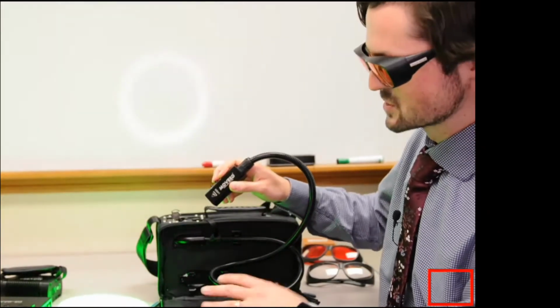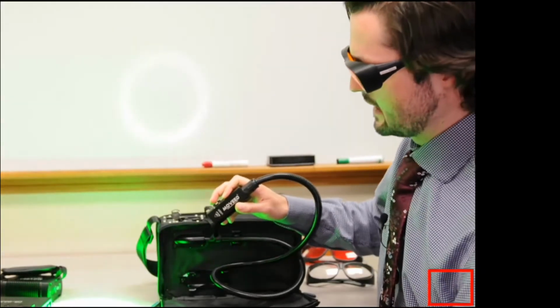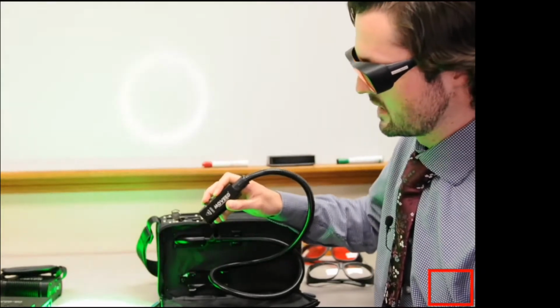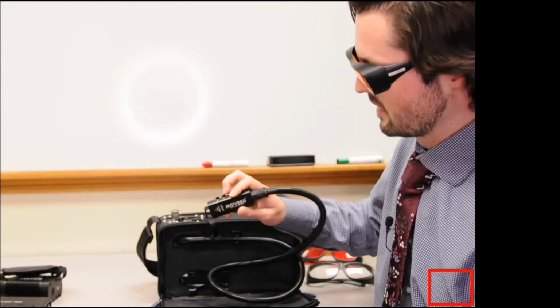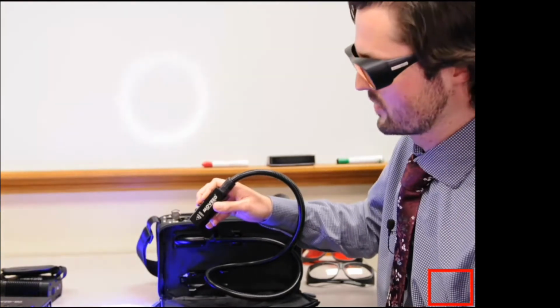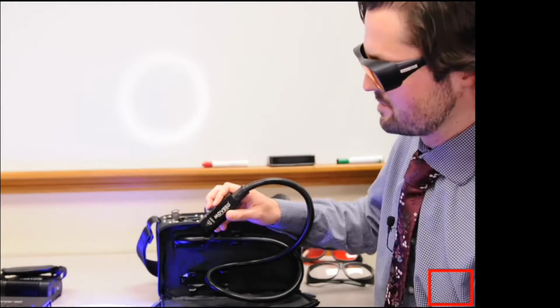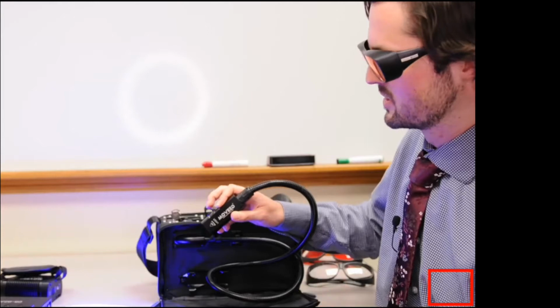You can see that kind of speckling, which really lets you know that you're working with laser light. What we can also do is if you click and then double click on up, we can actually change our wavelengths. So now we're going to be working with that blue excitation. So that's at 445. And again, same idea. You can move it up, you can move it down.